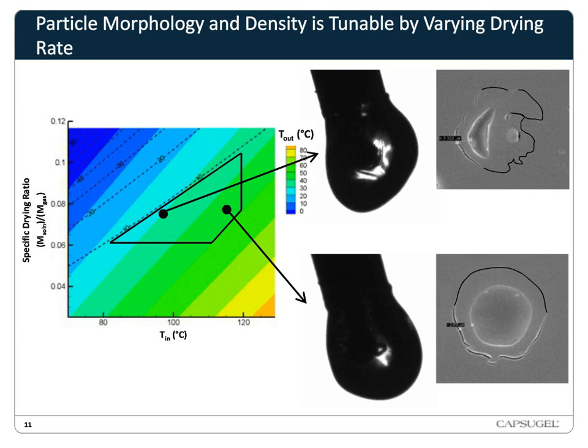And the resulting morphology is particles that look dense like raisins. And the SEM micrograph on the right is a cross-section of one of those particles. And you can see it generally looks like a collapsed sphere, like a raisin, maybe with a bit bigger wall thickness.